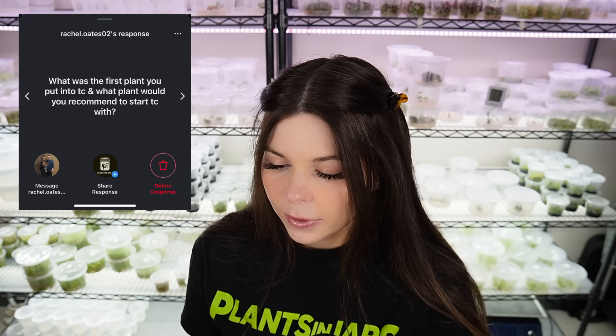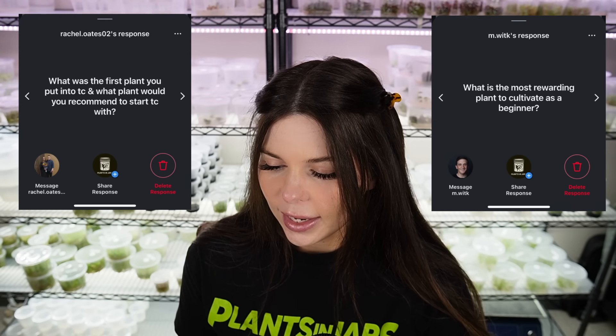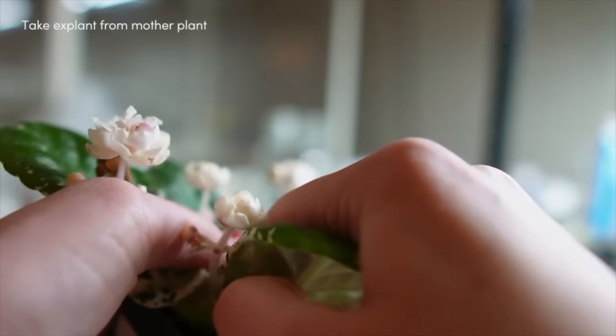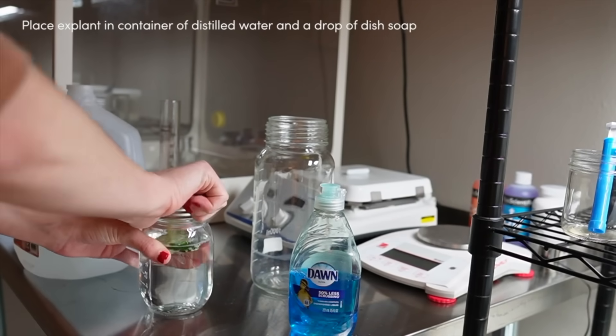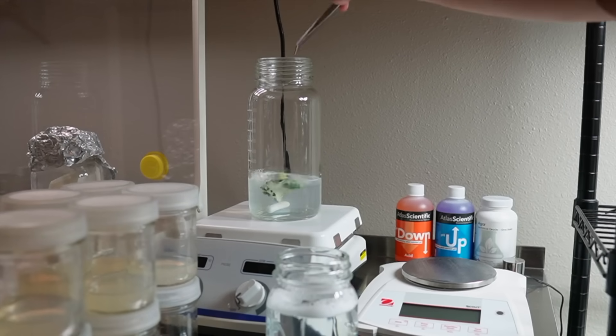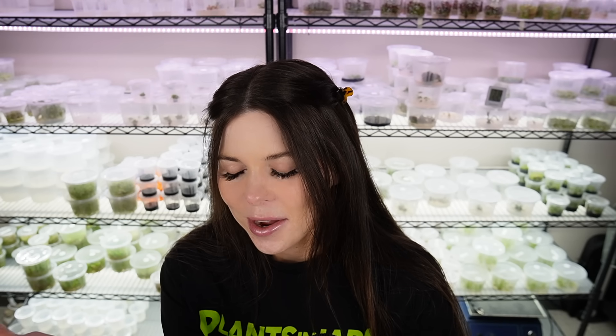Next questions: what was the first plant you put into TC, what would you recommend to start TC with, and what is the most rewarding plant to cultivate as a beginner? The first plants I ever tissue cultured successfully were African violets. Although they lack excitement, they are really easy for beginners — they're easy to sterilize and initiate in tissue culture. On the bottom shelf right there, those are all African violets and we had zero percent contamination rate when we put those leaf explants into culture, which is really, really good. The plants also grow really fast in culture and can be grown without any plant growth regulators, so they're super accessible for beginners.